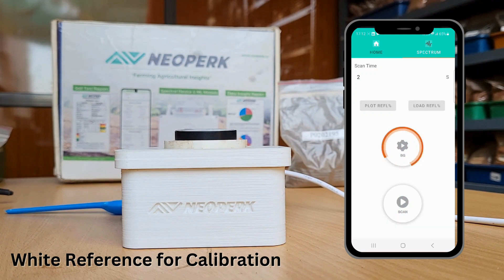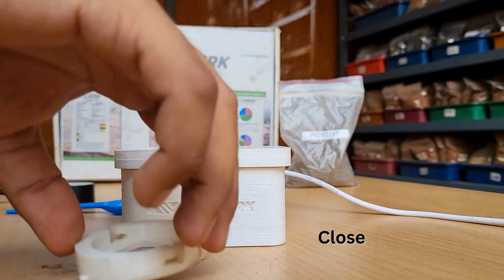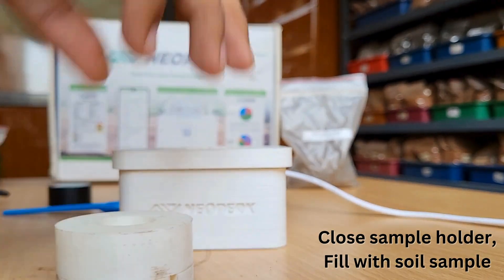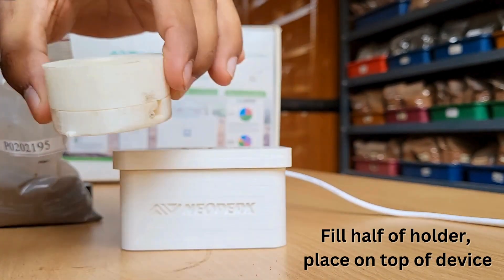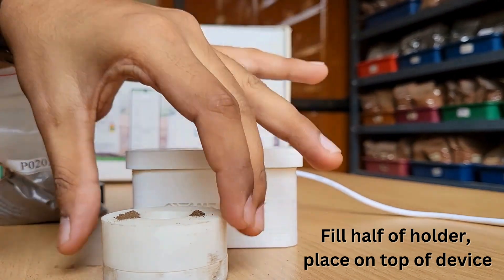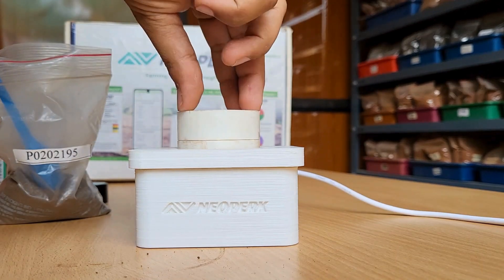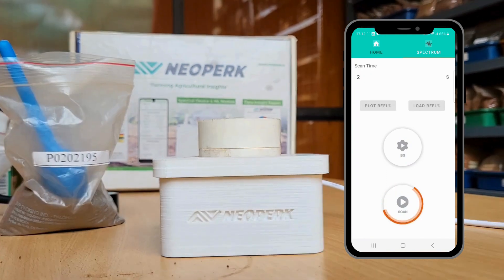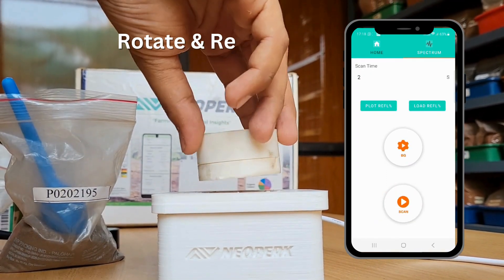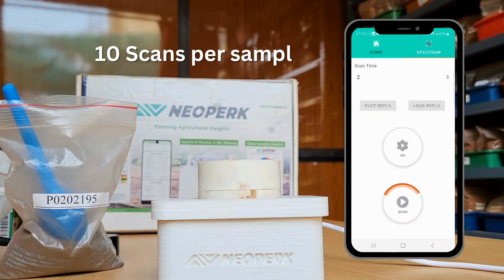Wait for the scan to complete. Now we'll close the sample holder and fill it with the soil sample. Ensure that the soil fills more than half of the sample holder and place it on top of the device. Click on the scan button to take a soil scan. After the scan is completed, rotate the sample holder and repeat the scan process. We need to take a total of 10 scans for each soil sample, which takes about 2 minutes.